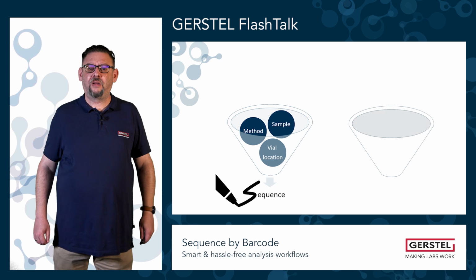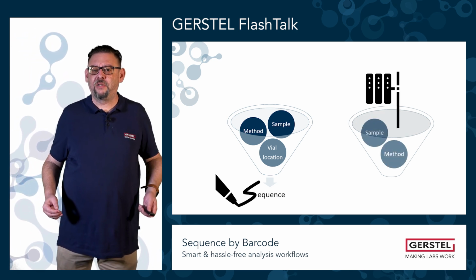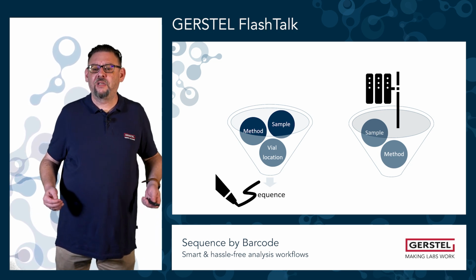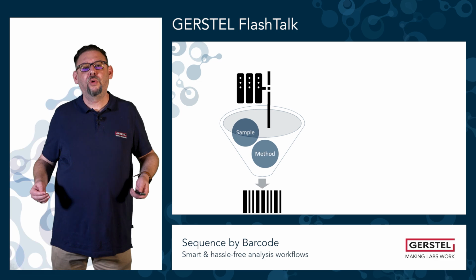Most of the information is most times already present in some kind of database. For example, a laboratory information management system, a so-called LIMS system. This information can be linked via a barcode with the sample.